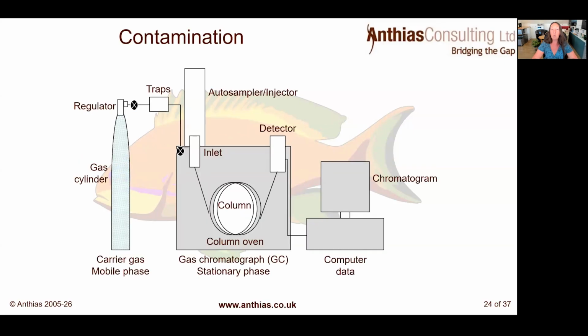Again, here what we want to be thinking about is our different modules. When we went through the steps of troubleshooting earlier, we thought about those different modules. So what you want to think about is, how can we isolate, for example, our autosampler? We can isolate our autosampler by doing something like a blank run. A blank run is where you don't do any injections.